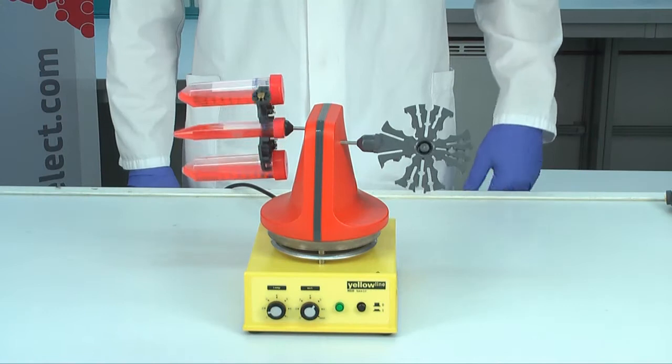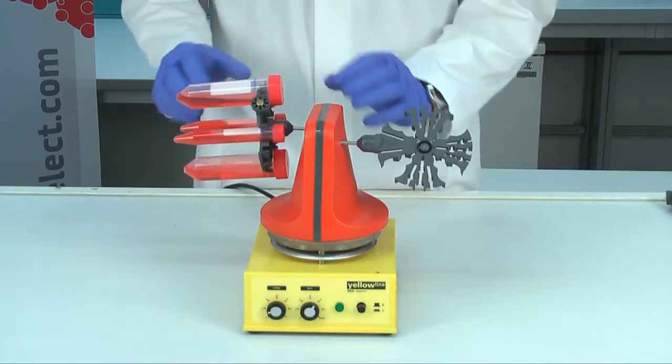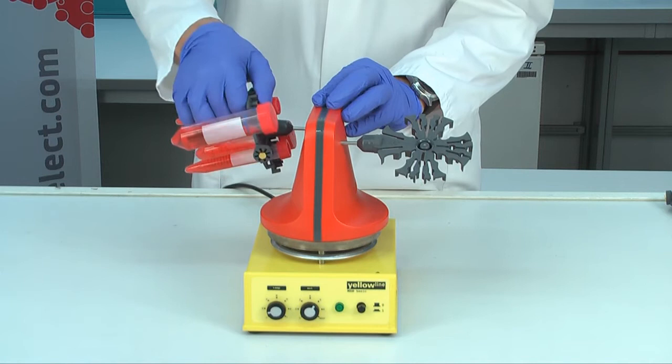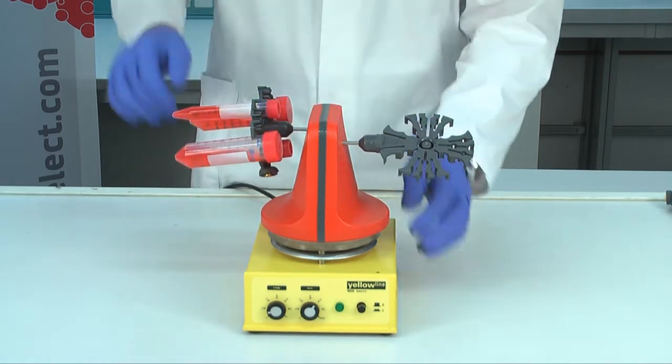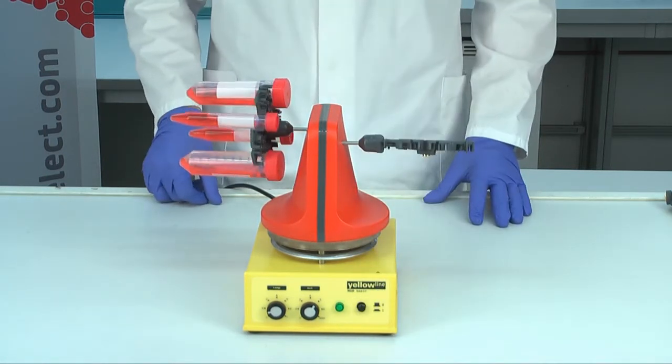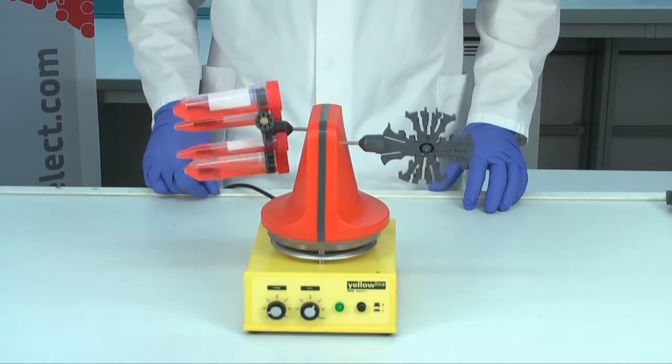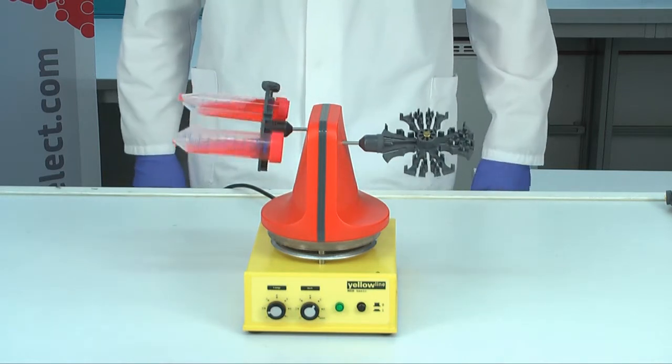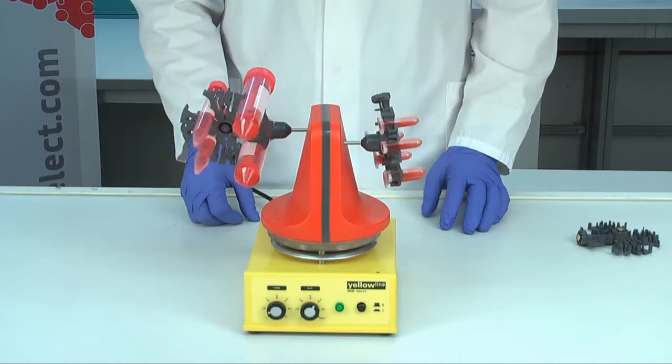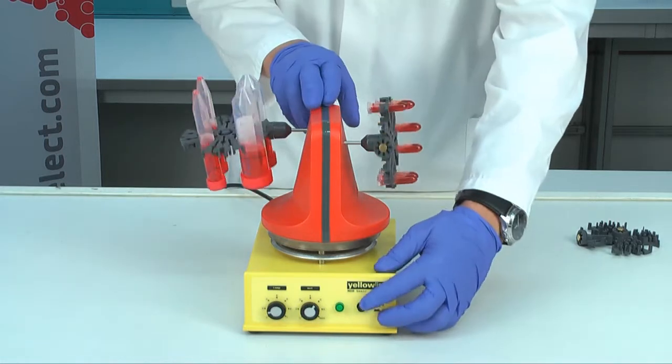You can use Pluriplex very flexibly with one arm or with two arms, either both arms doing the same movement or different ones.